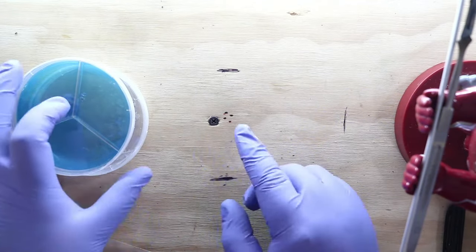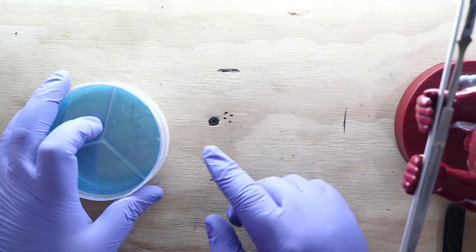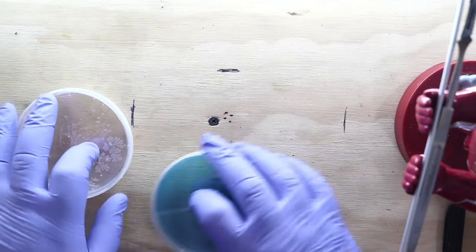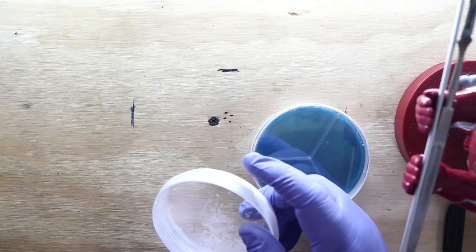Some people like what I call fish belly blades, which have a curved shape, like what you think of when you think of a scalpel, typically.